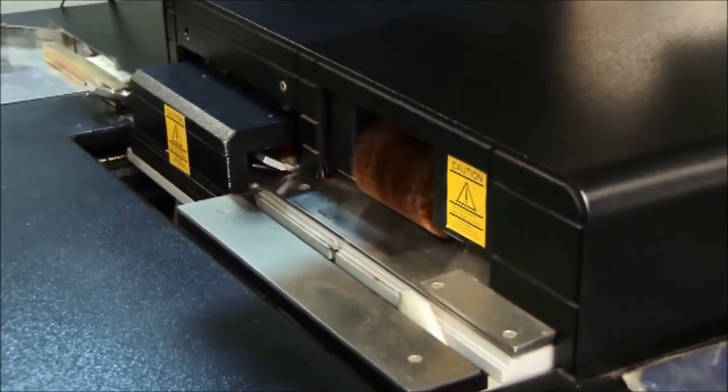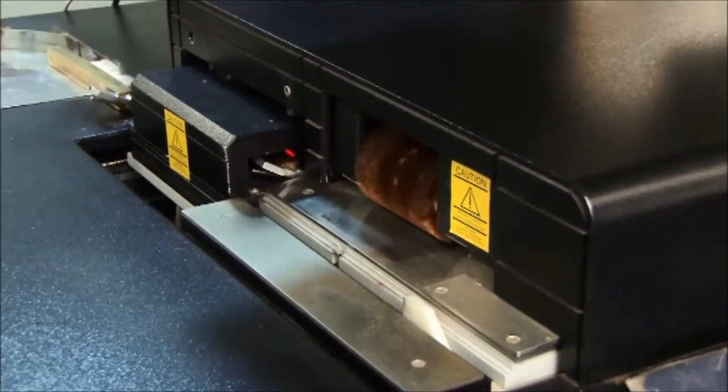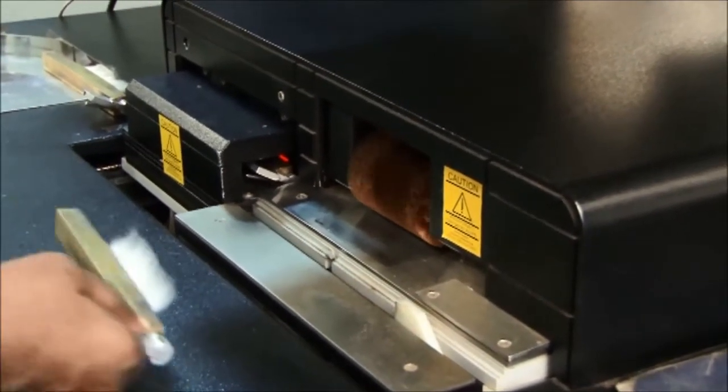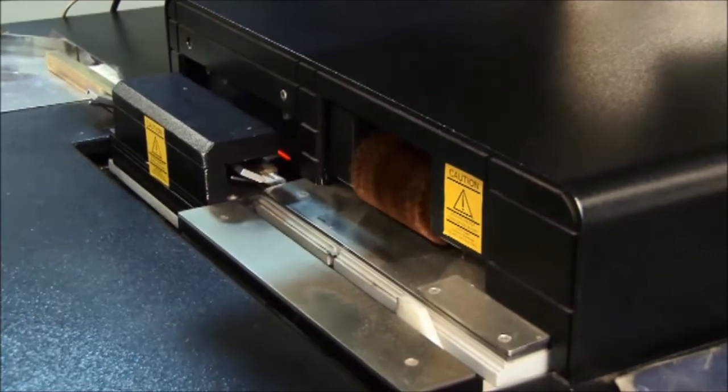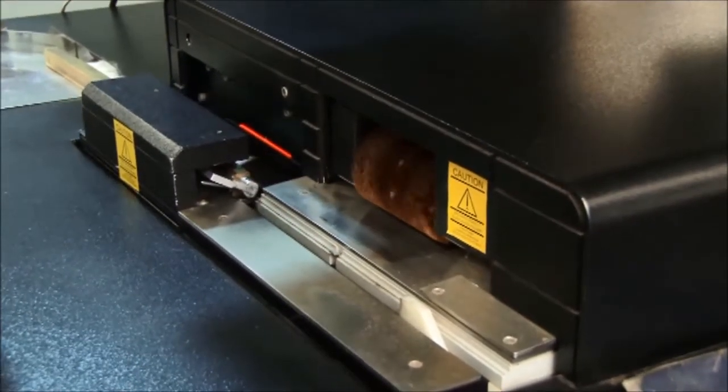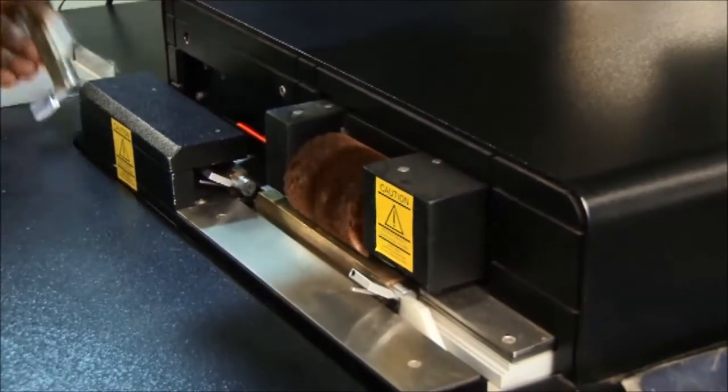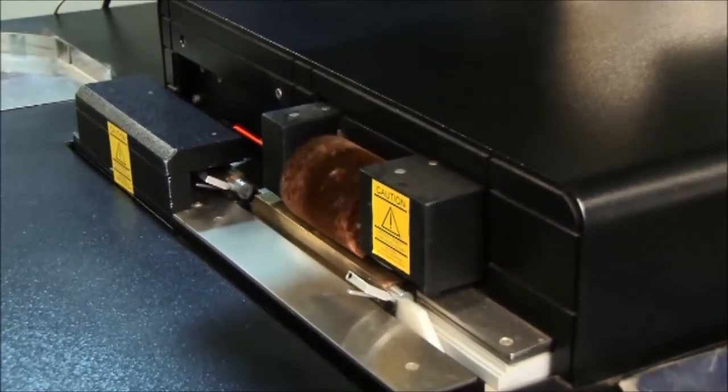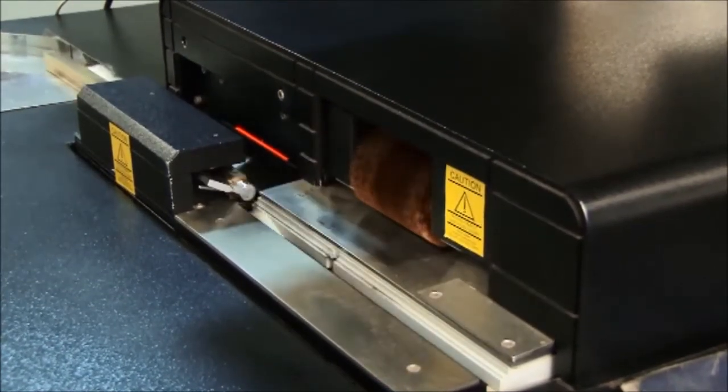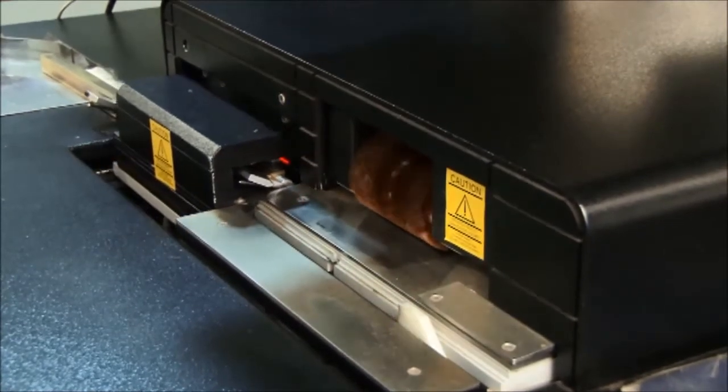Sampling should be carried out in the following steps: Mechanical sampling should be done at ginning and pressing. Sample should be minimum 300g. Identify the samples clearly. After sampling in a standard way, samples should be tested in a standardized way which includes the above steps.